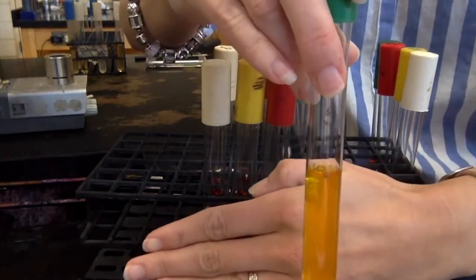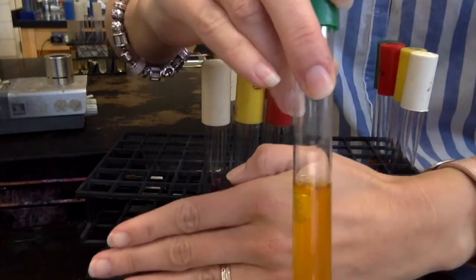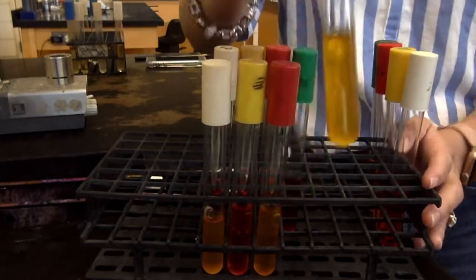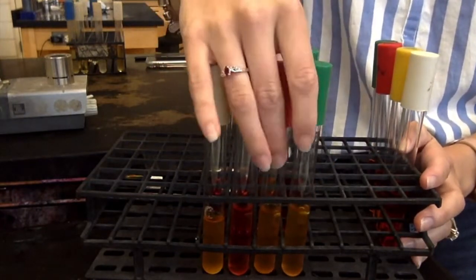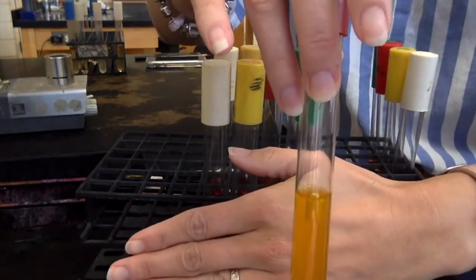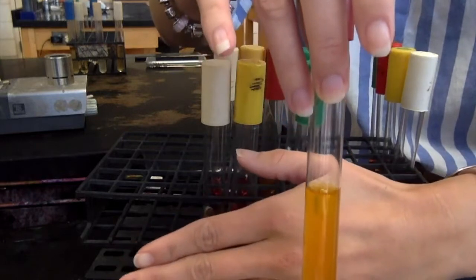So, here's my first tube, which is the lactose. You see that the tube is clearly yellow, so that's a positive result, and you see the gas bubble in the Durham tube. So E. coli can ferment the lactose, and it produces a gas bubble whenever it ferments. So moving on to the glucose. You will see the glucose is clearly yellow, and there also is a gas bubble. So that's a positive result for carb.